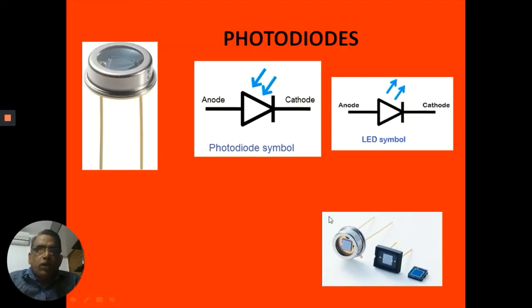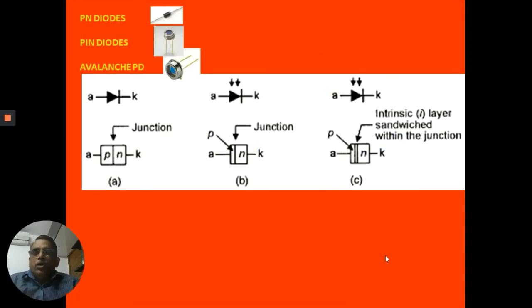These photodiodes come in different formats. This is for you to get a feel for the formats commercially available in the market, and you should understand them, because some of them are very important when you handle fluorescence machines or photochemical instrumentation. Now look at the details of the diodes.